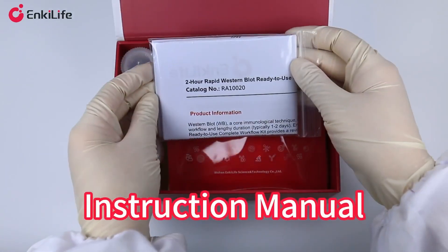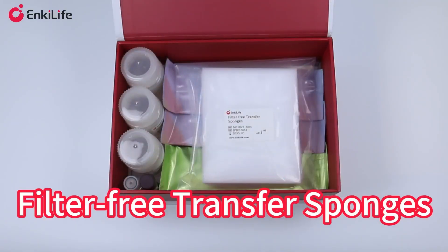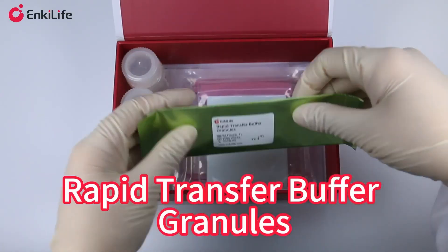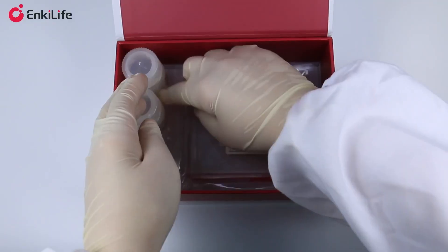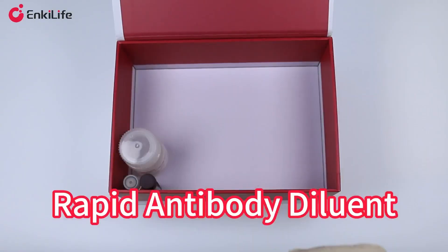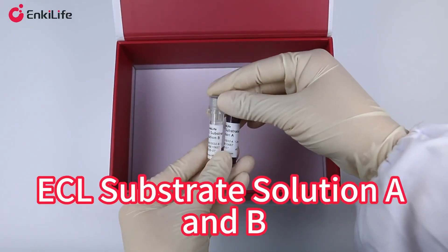Materials needed: instruction manual, protein loading buffer, protein marker, filter-free transfer sponges, electrophoresis buffer granules, rapid transfer buffer granules, PVDF membrane, precast gel, protein-free rapid blocking buffer, rapid wash buffer, rapid antibody diluent, and ECL substrate solution A and B.